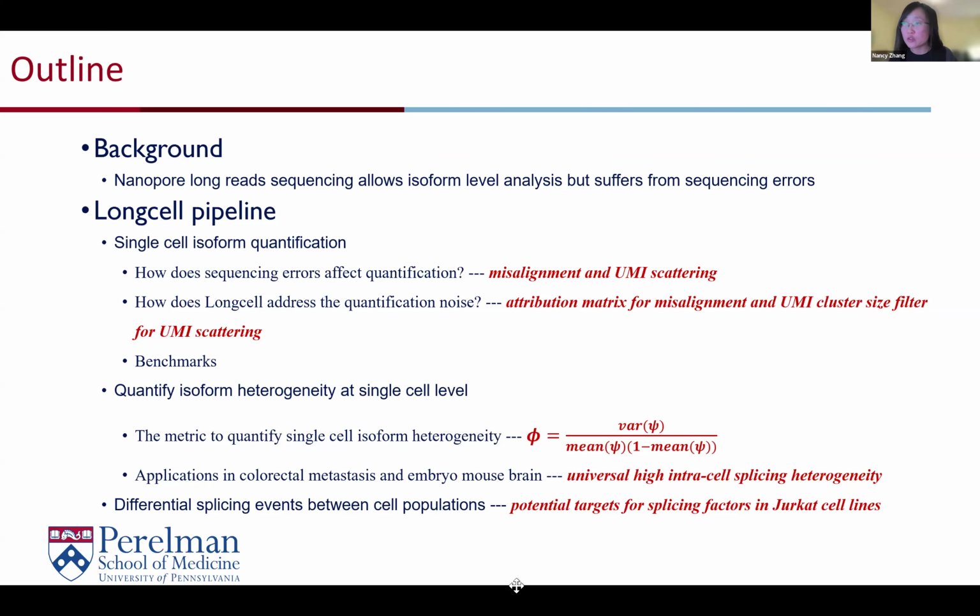Because with the full transcriptome, the single cell libraries are so low in count, right? So then you can't actually profile the isoform expression for many genes very well. In our data, both the real data as well as our simulated data, which is simulated based on the real data so they mimic those numbers, we have both full transcriptome and targeted. So targeted, there's only going to be a few genes. Full transcriptome, there's more. If that's the question, I'm not sure.